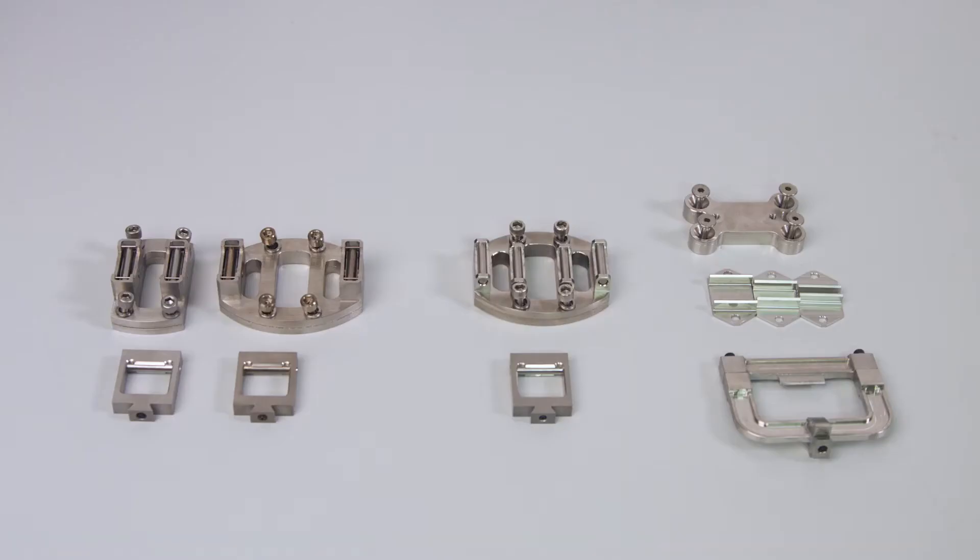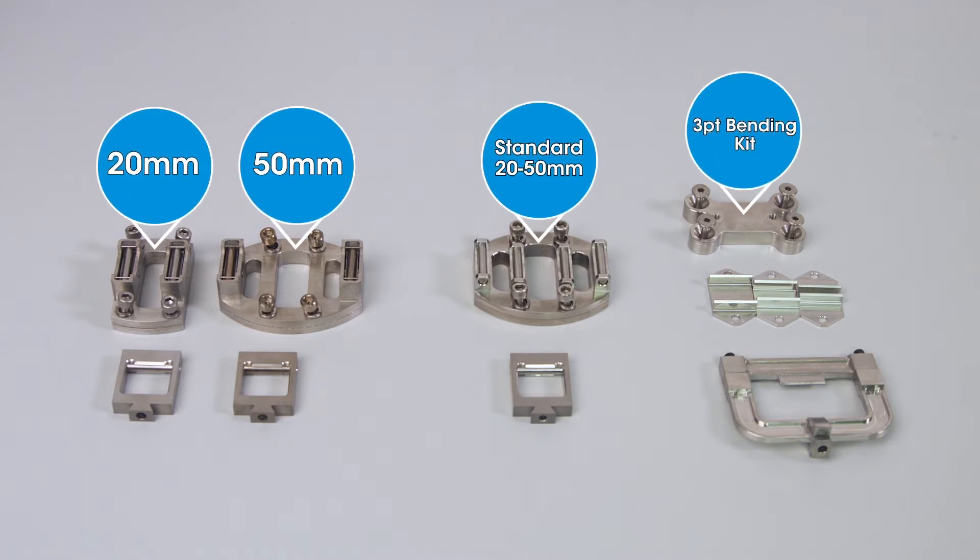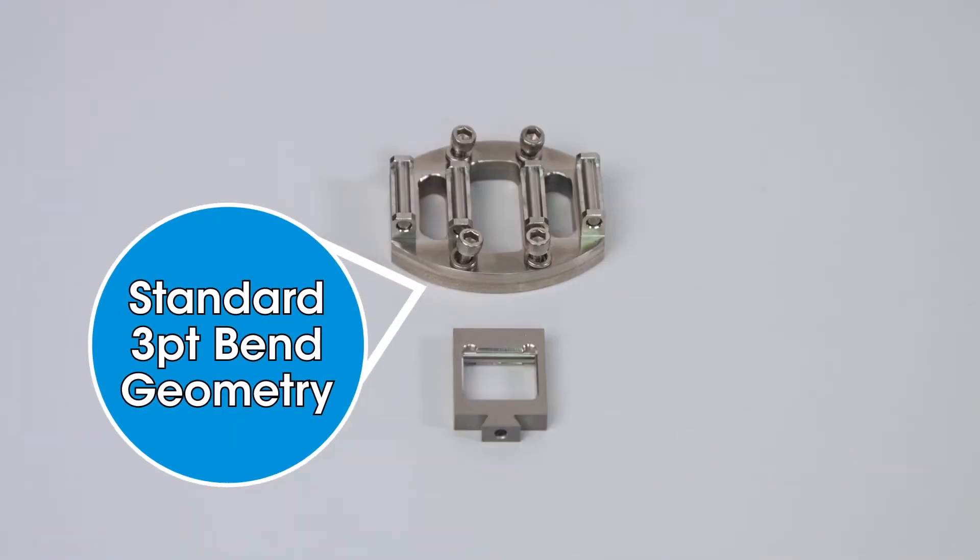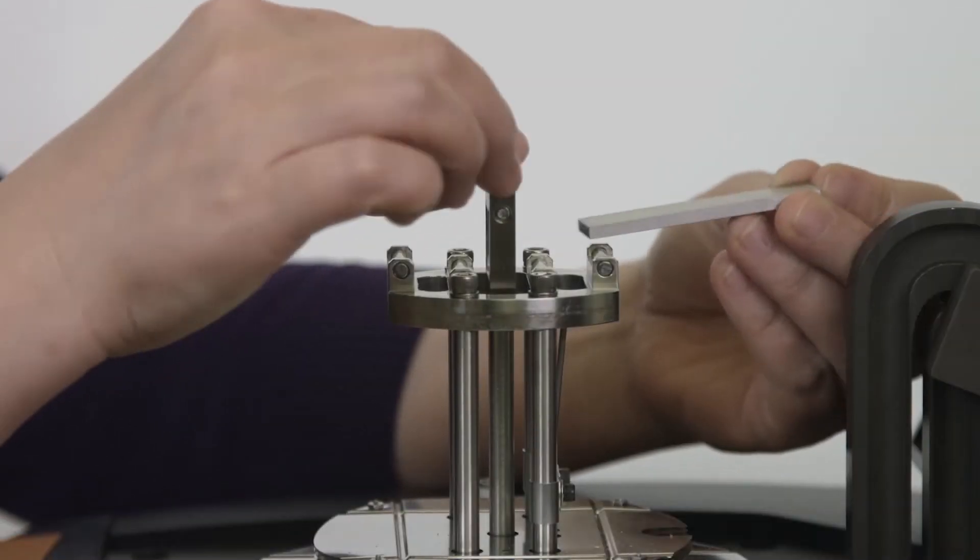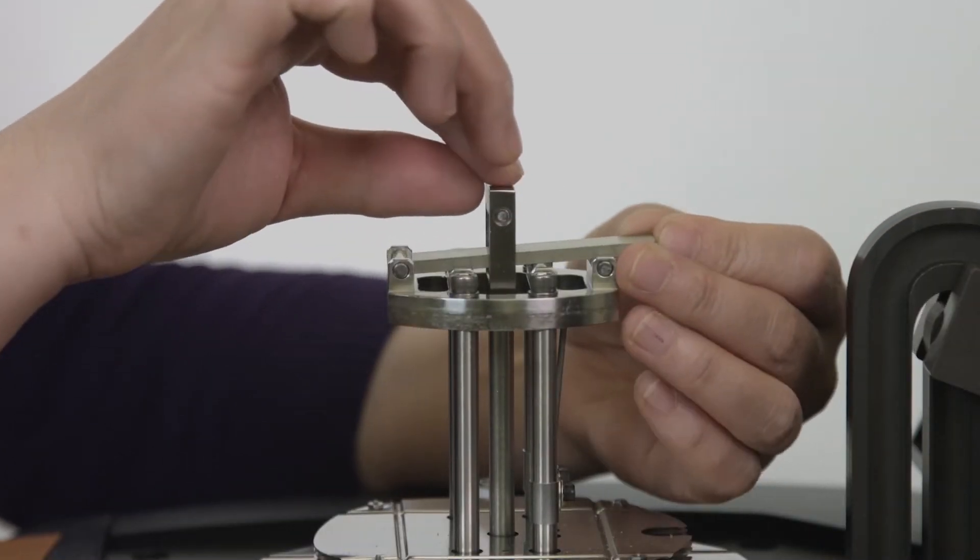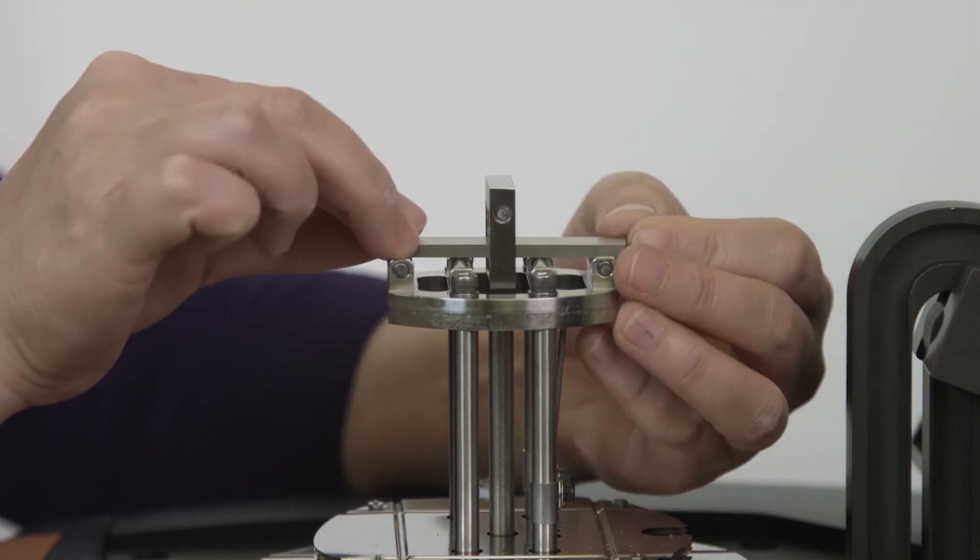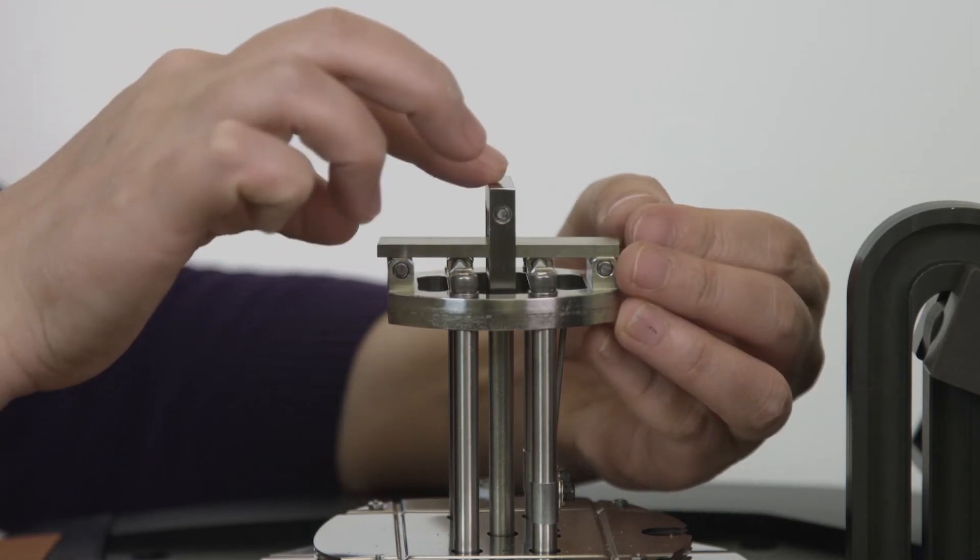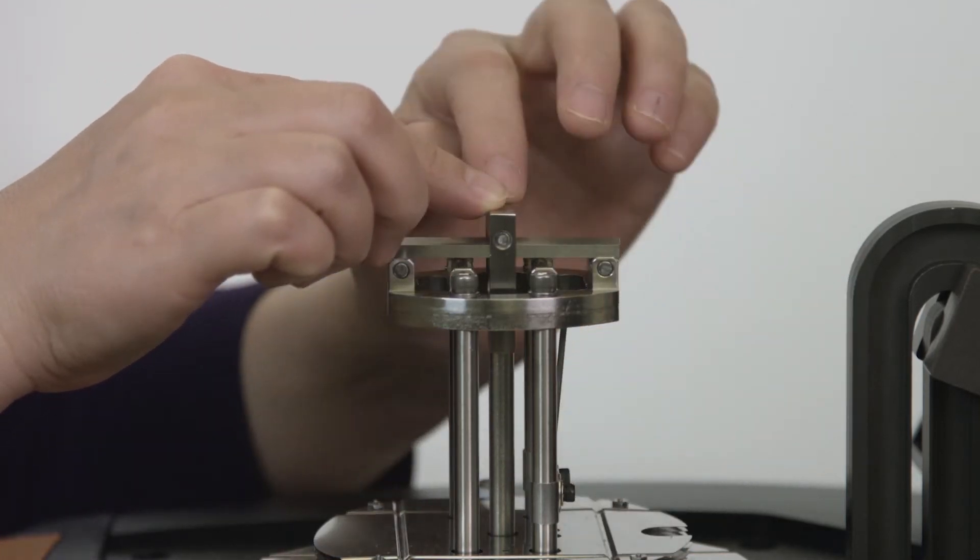TA Instruments offers varieties of different size three-point bending clamps. This standard clamp has both 20 millimeter and 50 millimeter built-in one piece. We also have separate 20 millimeter and 50 millimeter low-friction three-point bending clamps with rock and roll designs. This design helped to improve sample to clamp contact in case the sample is not perfectly flat.